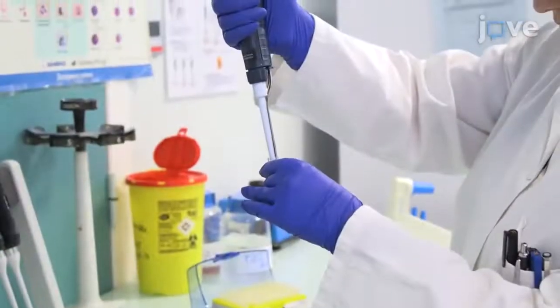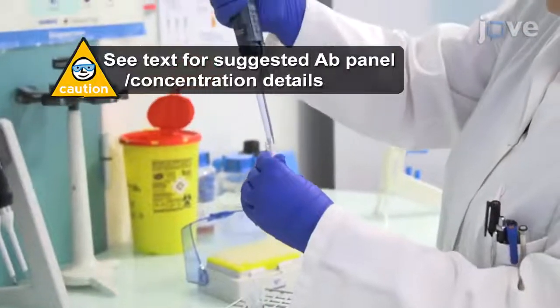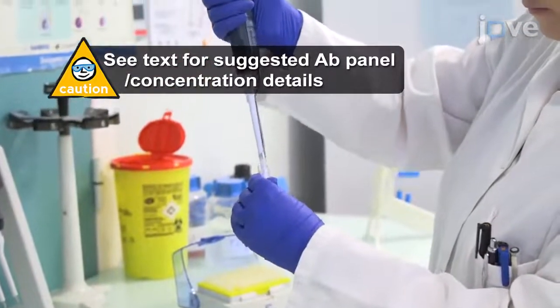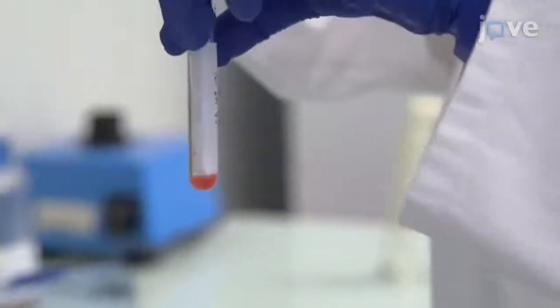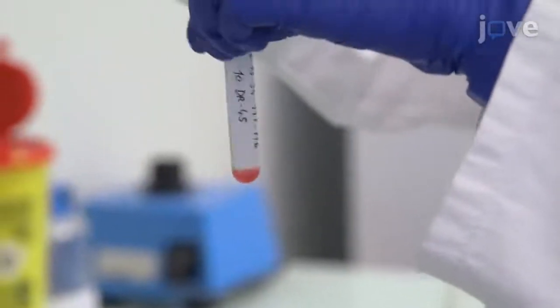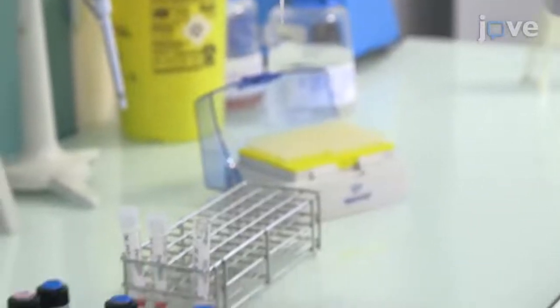After thoroughly mixing the cells, pipette equal volumes of the cell antibody solution into three new polypropylene tubes and bring the final volume in each tube up to 200 microliters with fresh washing buffer as necessary. Next, add the appropriate volume of antibodies against the cell surface markers of interest with mixing.